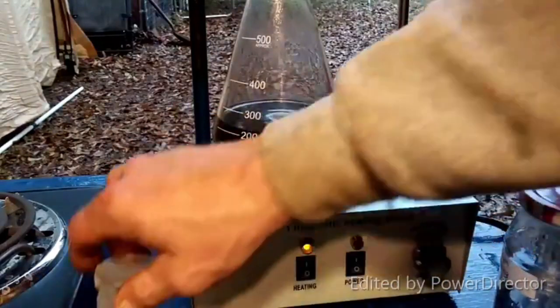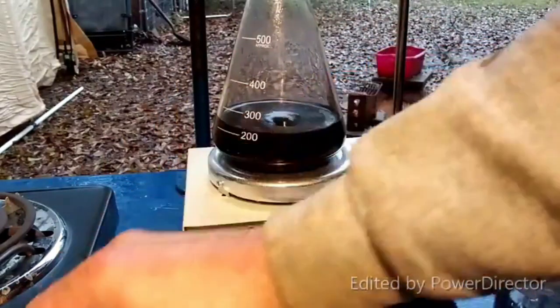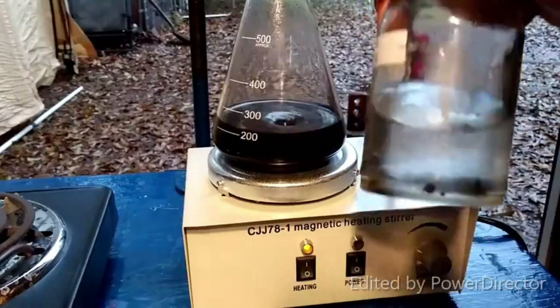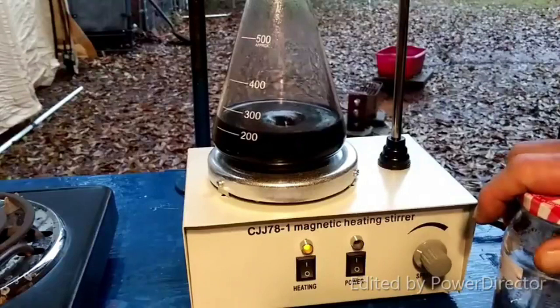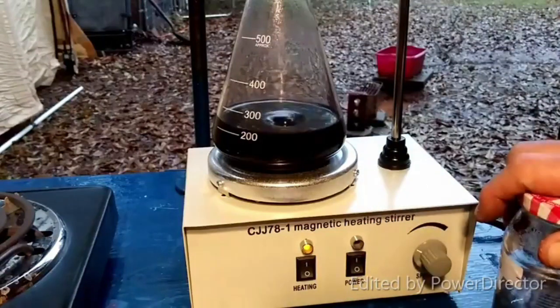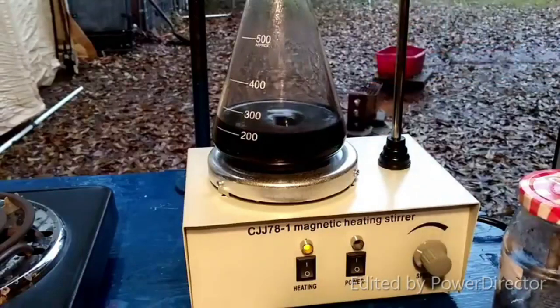Anyway, we still have enough solution. I am going to try 3 more out of what I've got here, and then I'm going to try to use the metallic platinum that I produced thus far to create another platinum compound. Not sure how that's exactly going to work out, but we're going to give it a try. I mean, if I were to get 8 successful syntheses in a video, it just wouldn't be a Poor Man's Chemist video. One of them's got to fuck up somewhere. And this one doesn't count. Well, it does count, it just doesn't count that way. So, I'm going to go ahead and move on to making the next platinum compound.